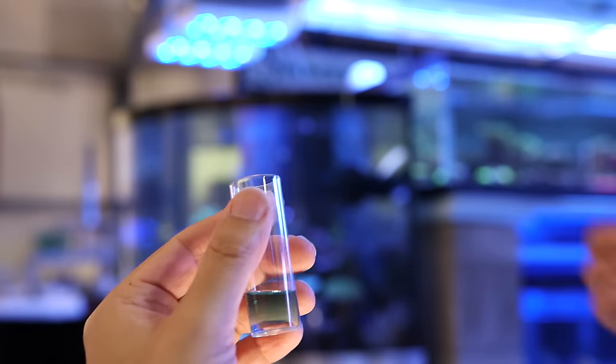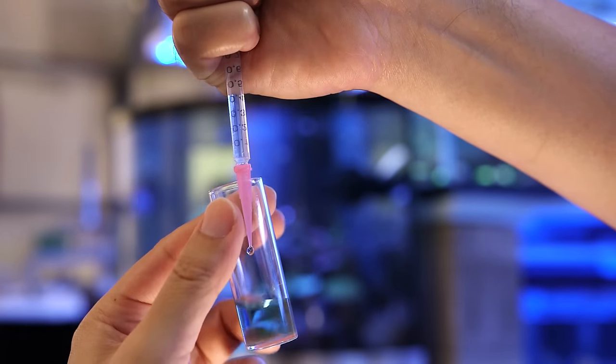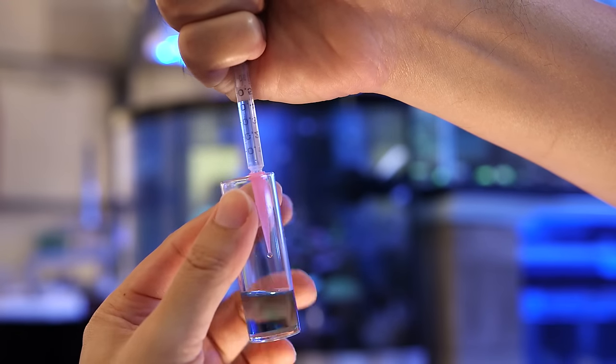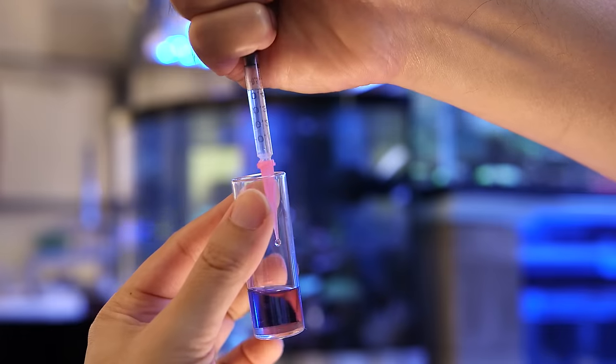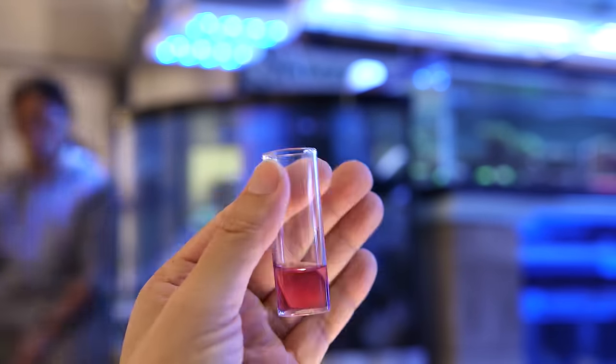The idea is once the buffering capacity of the sample is exceeded, the blue stain will quickly change to a pink color. The amount of that second reagent needed to change the color from blue to pink will determine the DKH of the salt water sample.